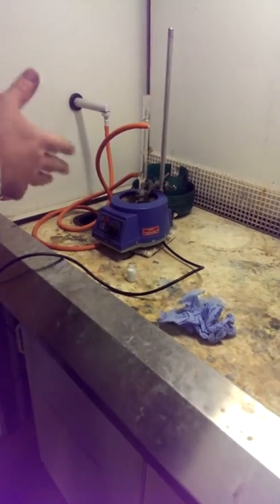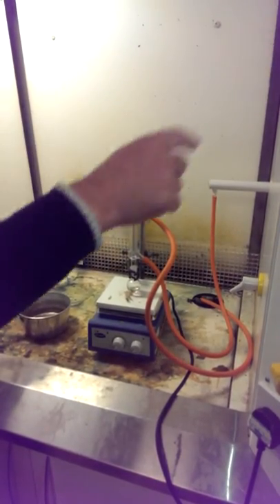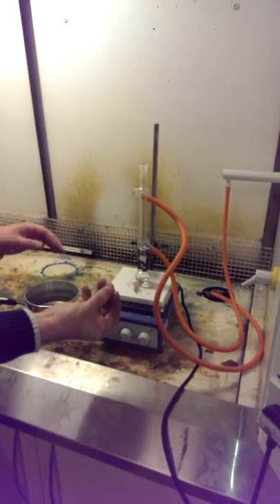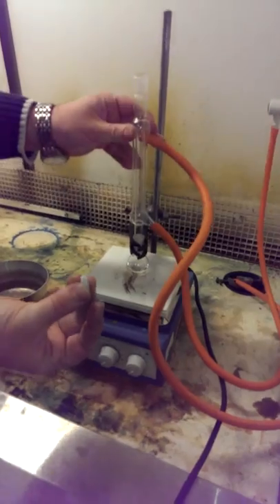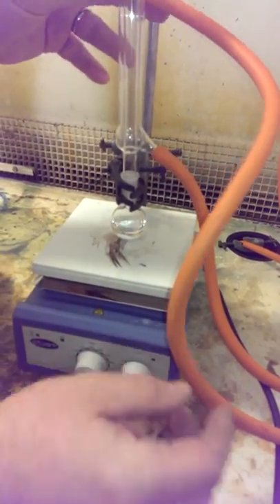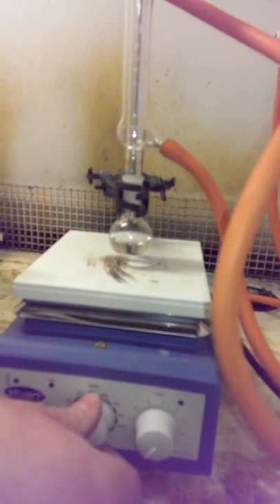So you can either heat in that way via a mantle, or you can return to a hot plate stirrer. I'll just turn this off for the moment. With a hot plate stirrer, you don't need anti-bumping granules, you need a magnetic flea. Get an appropriate size flea, drop it down into the neck of the flask. Make sure that we just turn it on, it's spinning. That's a nice spin, that's perfect.